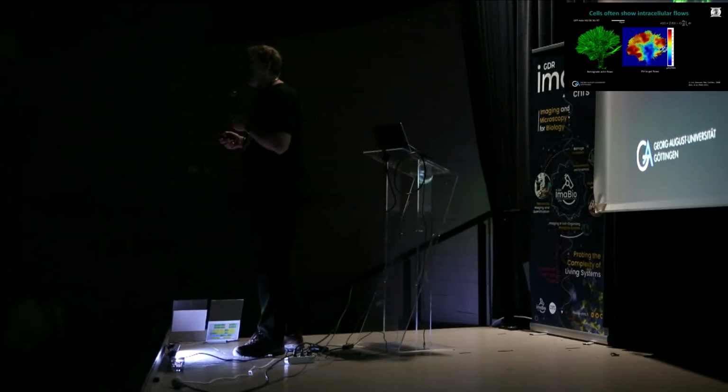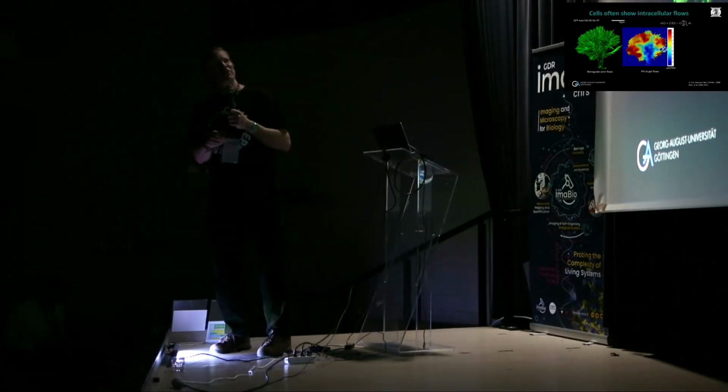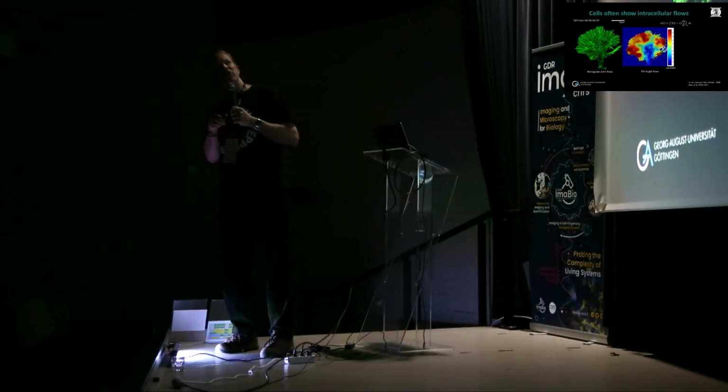We were making jokes about showing some equations. So there's not a lot of equations, but at least this one I wanted to show. That's the simple version, basically not a tensor description. But what that tells you is, if you know the flow, this U would be the strain, the deformation if you want. That's the strain rate, the velocity. We need here in this E the relaxation modulus. We have all the mechanical properties involved. And then out of this, by integrating over the history, you can actually calculate the stress in the system that would be explained by the flows that you see.